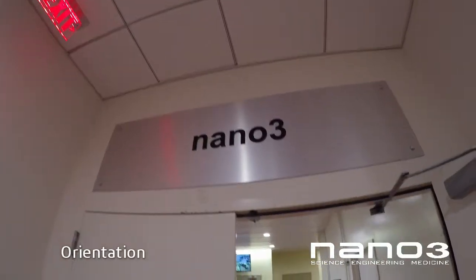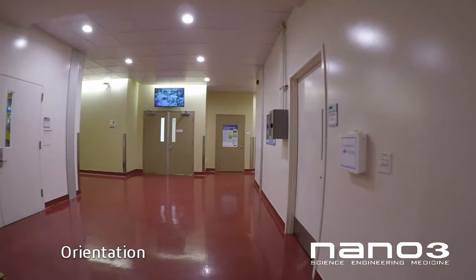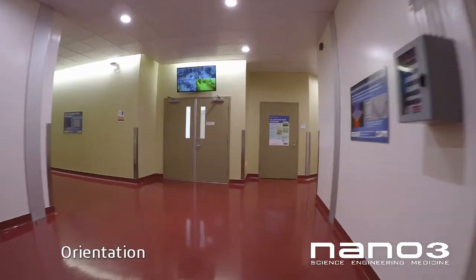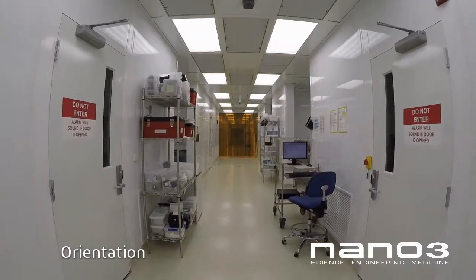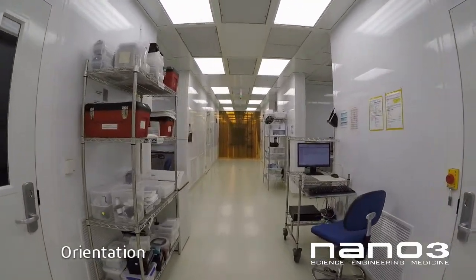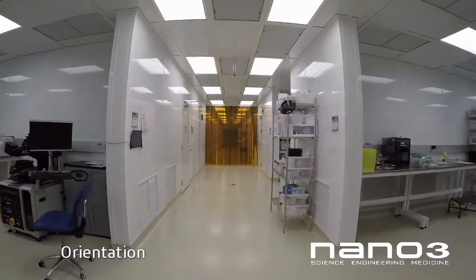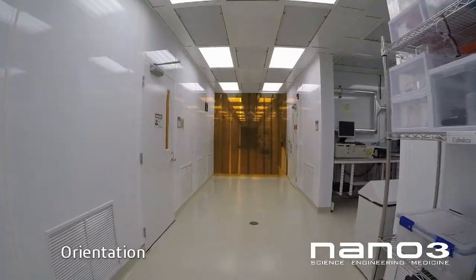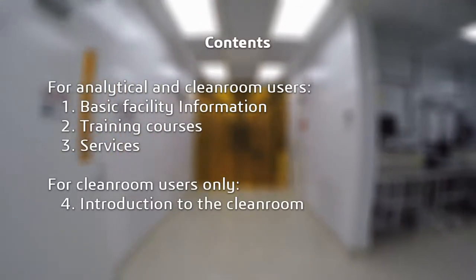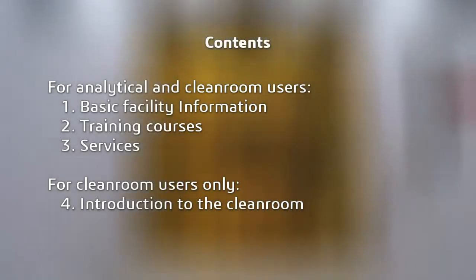Welcome to Nano3, the main facility of the San Diego Nanotechnology Infrastructure, or SDNI. We are one of 16 nationwide sites of the NSF-supported National Nanotechnology Coordinated Infrastructure, or NNCI. We provide advanced capabilities for fabrication and characterization in our state-of-the-art cleanroom and analytical labs. In this video, we will cover basic facility information, training courses, services, and an introduction to the cleanroom.